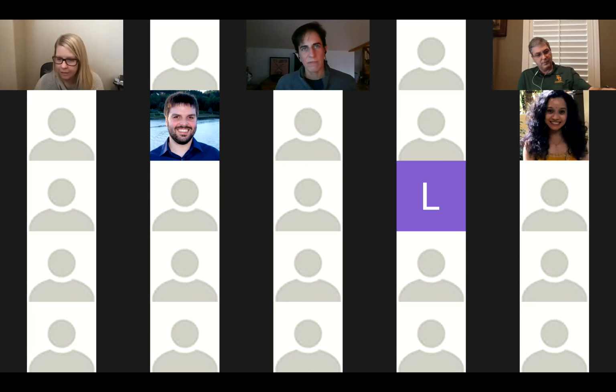So I guess I'll ask a question if nobody from the audience has one. I'm always curious with these tools. You talked a little bit about the single cell RNA, but what else are the big picture goals or the big additions that you feel should be added into this data? Are they tools, or more data sets, or what's your vision?